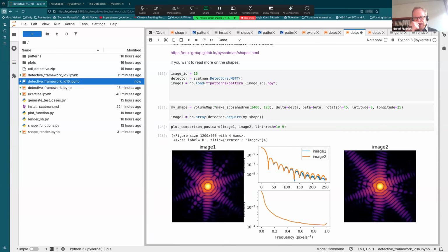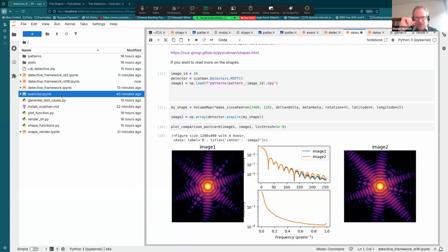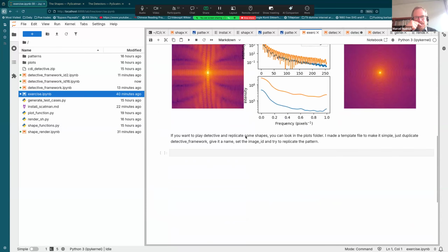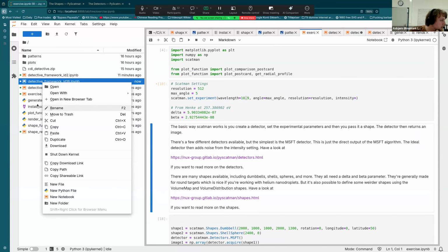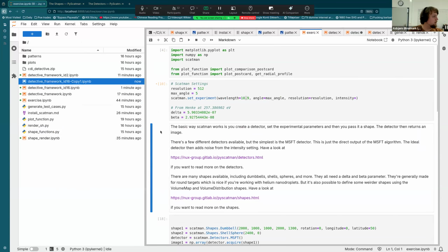That could also be interesting to see for the cube, right? Yesterday we looked at the cube, where this diffraction pattern changes a lot depending on whether you strike the cube face on, side on, or corner on. I think the symmetry probably also changes. Yeah, we can look at this quickly.